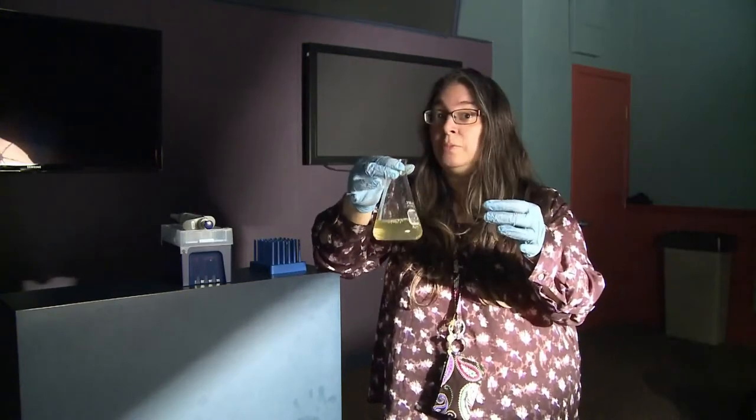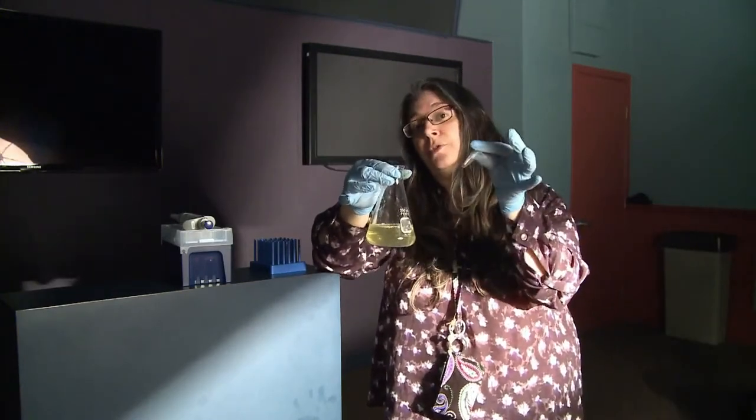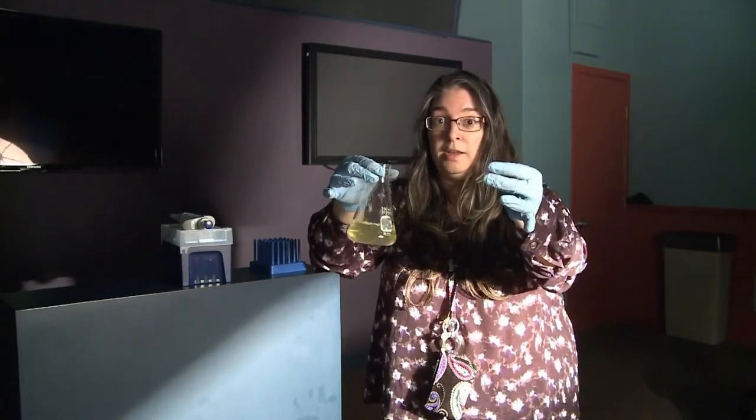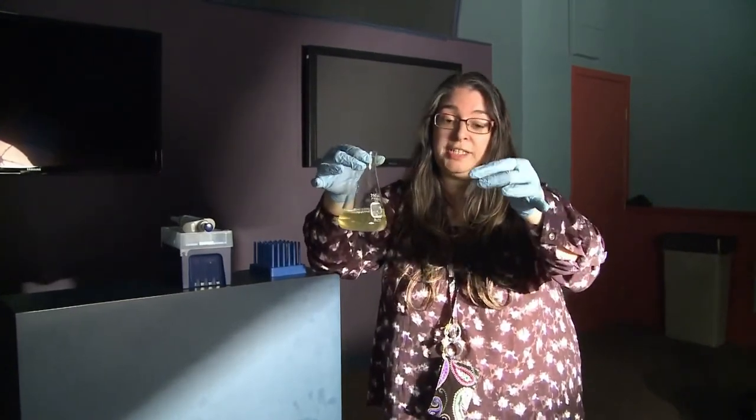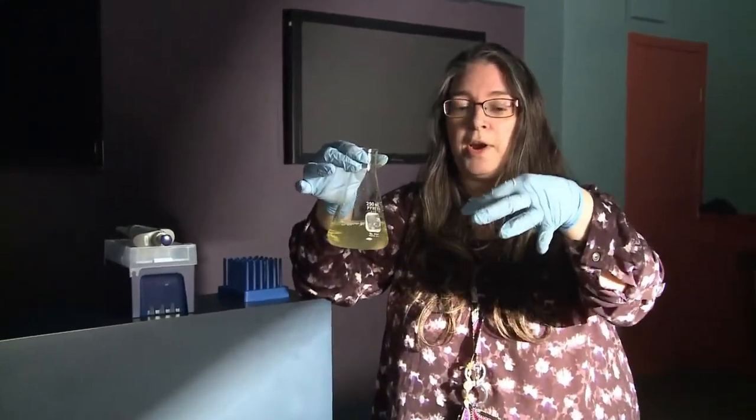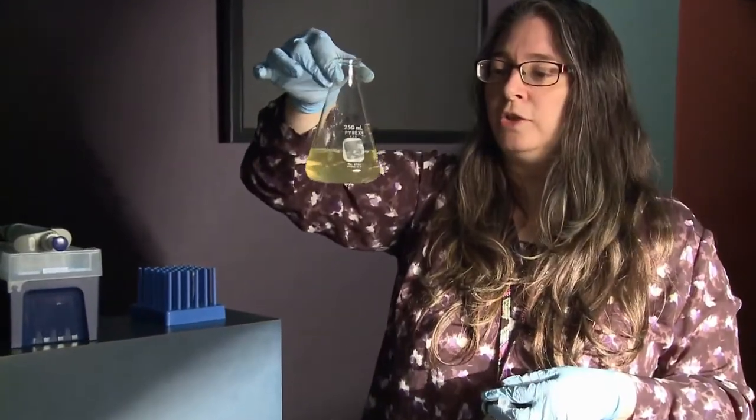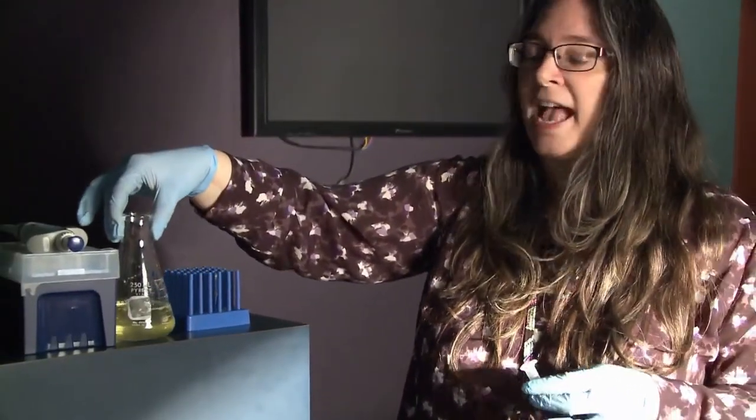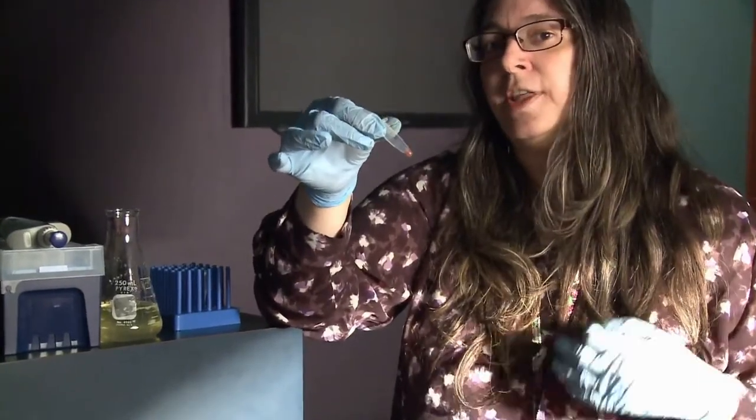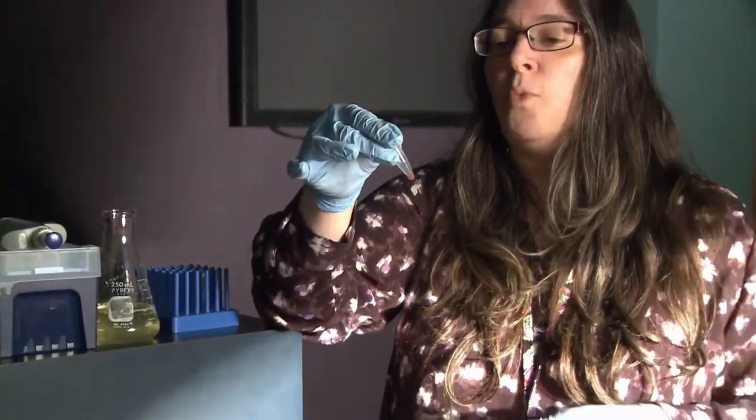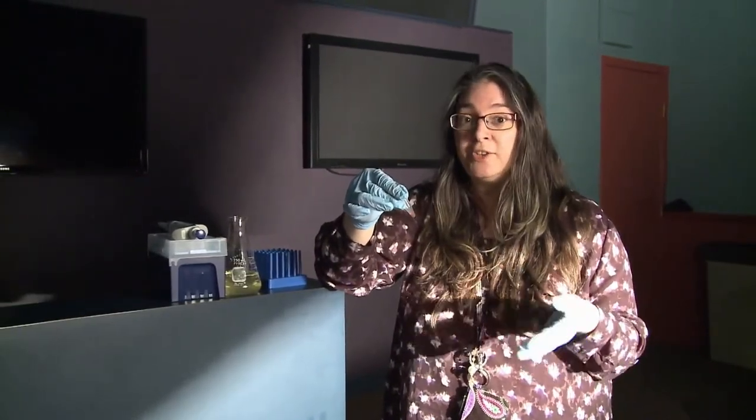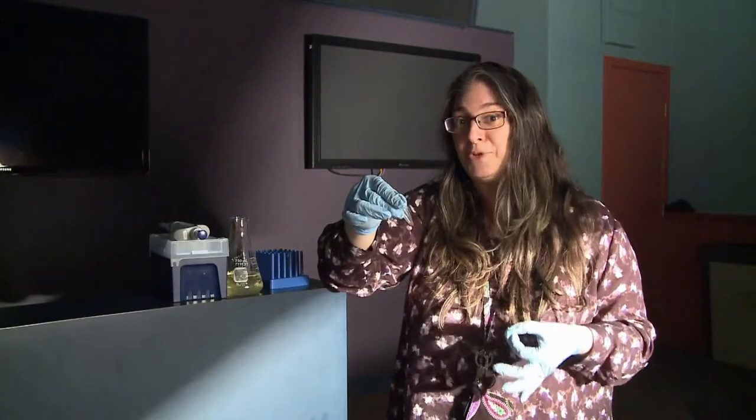We're going to see how luminol reacts when it comes in contact with real blood. The blood we're using is from chickens, actually from chicken livers bought at the supermarket. We're going to mix the compound luminol. Luminol has an interesting reaction when it comes in contact with blood cells. It reacts with the iron that's connected to the hemoglobin. When it comes in contact, a chemical reaction occurs that releases energy in the form of blue light or blue photons.